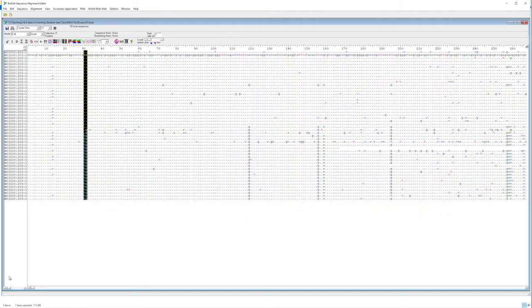And in fact, we can probably see that by just looking at this GC position here. Was there a G or was there a C at that position in this actual subject that we have sequenced? I don't know, but we know we had primers with Gs and Cs, and where we amplified with the primer with the G, we got the G, and where we amplified the primer that had the C, we got the C. But what the subject had, we can't really tell from here. So we have to make sure that we start our consensus sequence after the primer ends.